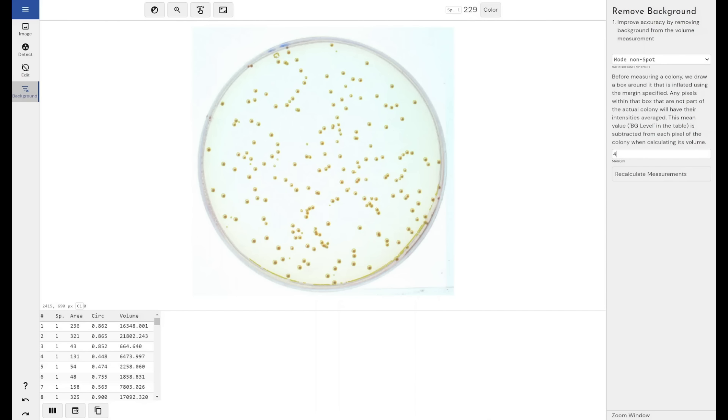Four at the moment is the default, so it's 4 pixels. It will grow the circle around the colony invisibly by 4 pixels and then take the average value within those 4 pixels around each colony and apply that as the background removal method, that average as the background removal value.